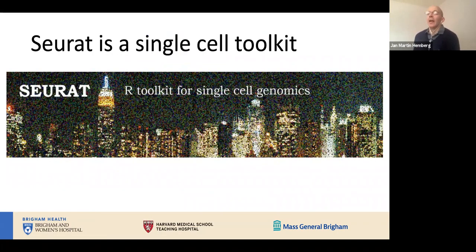So finally, what I should mention is that many of you have already talked some about Seurat, and many of you may have already heard about it. This is probably the most widely used and popular method in the whole field. It's basically a toolkit that will do pretty much most or all of the steps that I've told you about before. There are methods in Seurat for doing this.